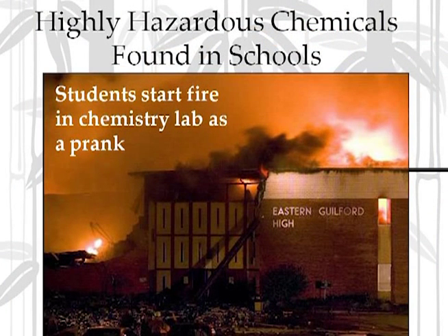So when we're talking about hazardous chemicals in schools, there are hazardous chemicals that would count as hazardous waste, and then there's highly hazardous chemicals, which actually pose an imminent threat of explosions or reactions or other things that could create a very hazardous situation in the school. So that's what I want to focus on in this discussion.